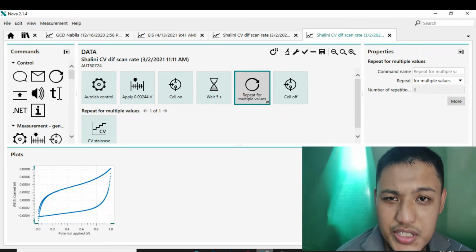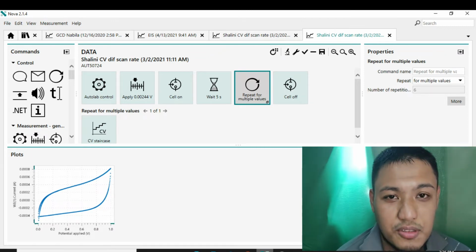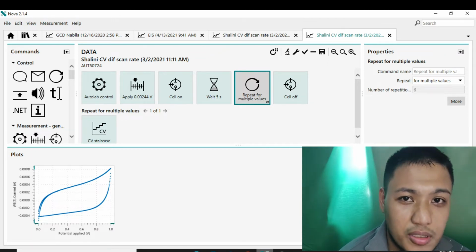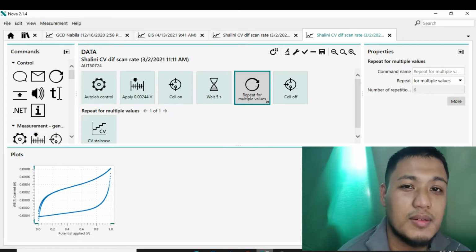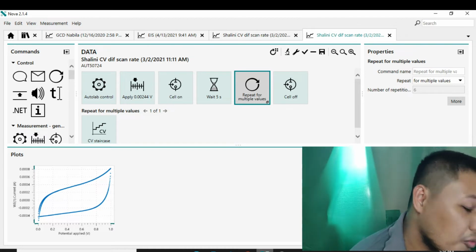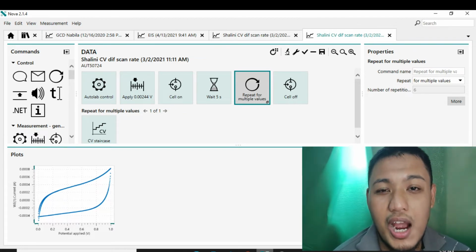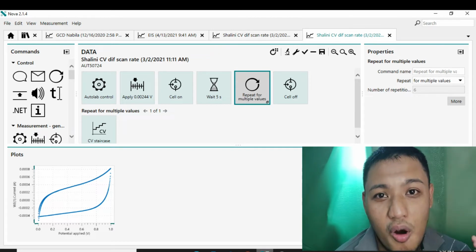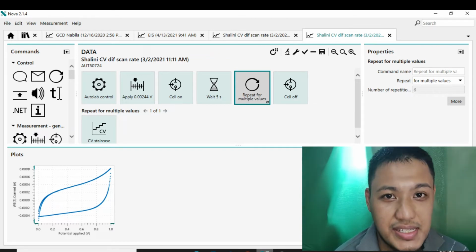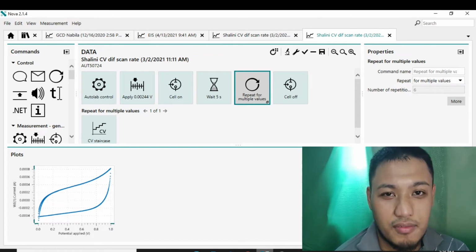Sometimes the journal only reports up to the 2 electrode system, sometimes the 3 electrode system, and sometimes both. We're going to do the full 2 and 3 electrode, but in this video I'm going to share how we run the electrochemical test for the 3 electrode system first.